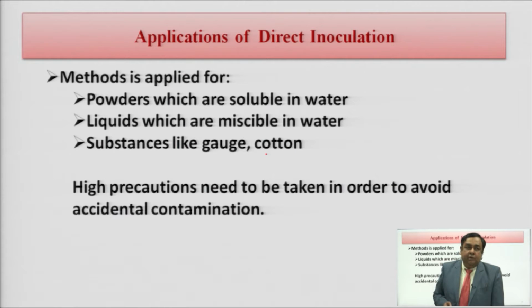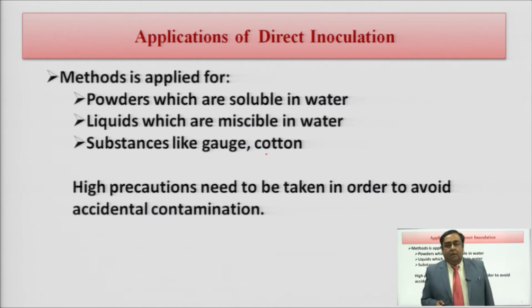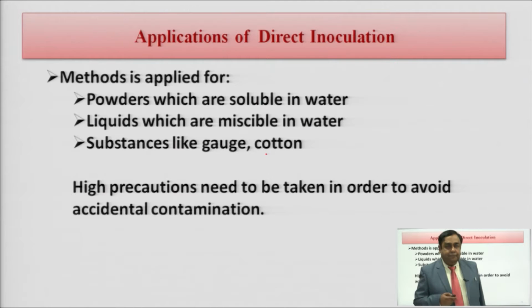We use them for liquids which are water miscible in nature. We also use them for various solid substances like gauze, cotton, catgut, syringes and so on.